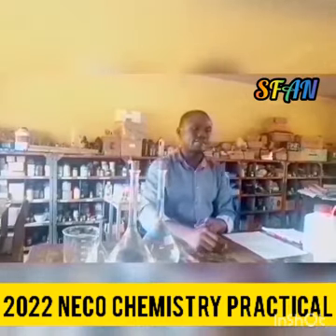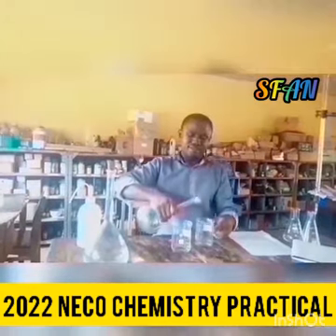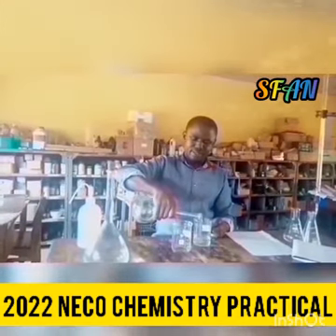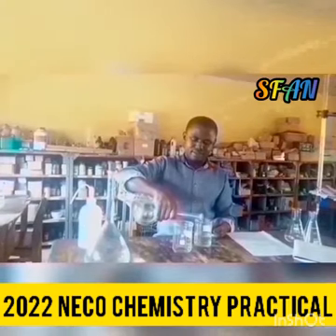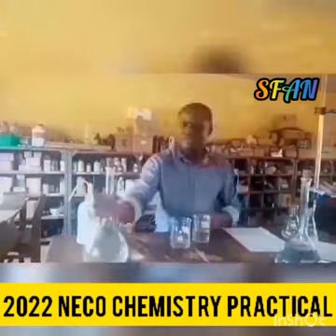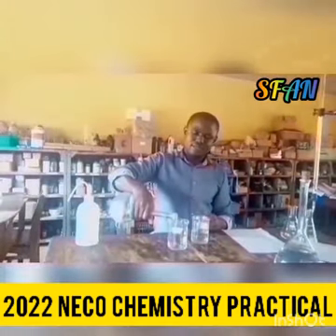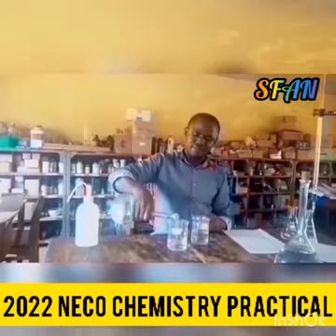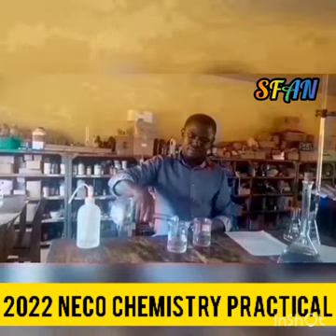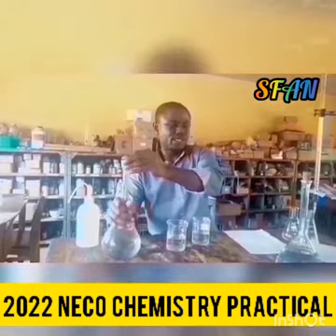So now I'm going to transfer 150 cm³ of my trioxonitrate(V) acid to my beaker, and I'm also going to transfer 150 cm³ of my sodium trioxocarbonate(IV) to another beaker labeled B. And then we are ready for this titration.